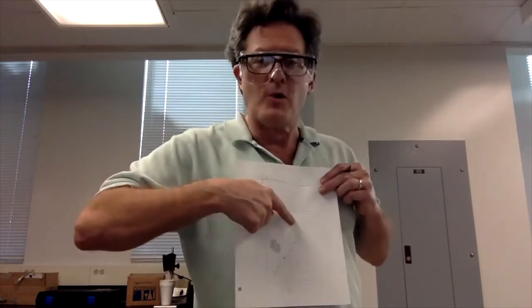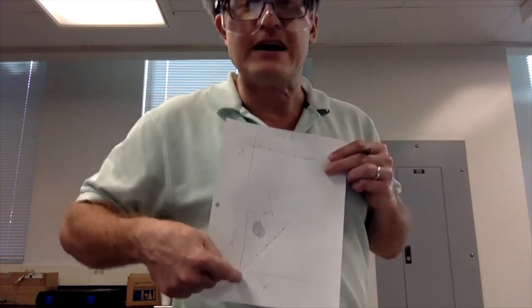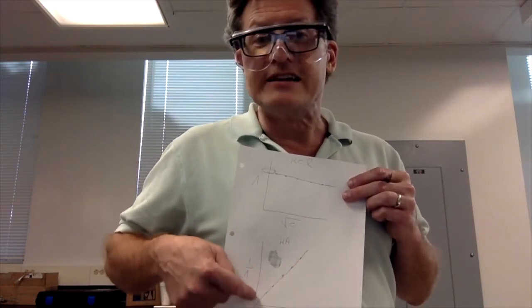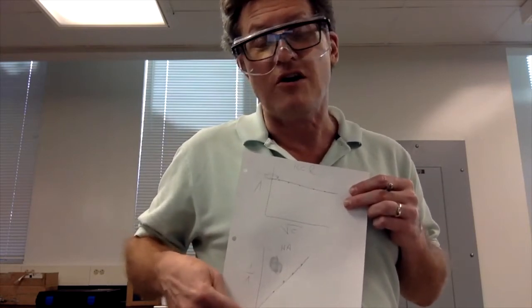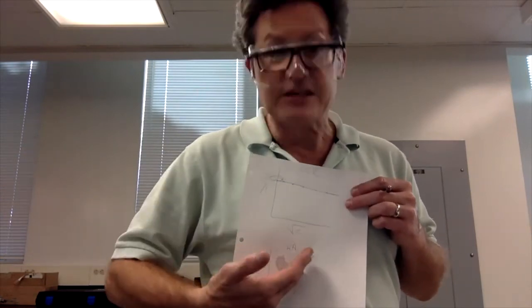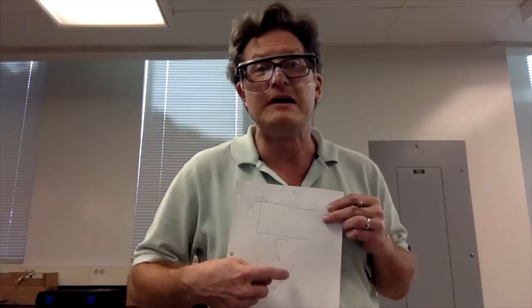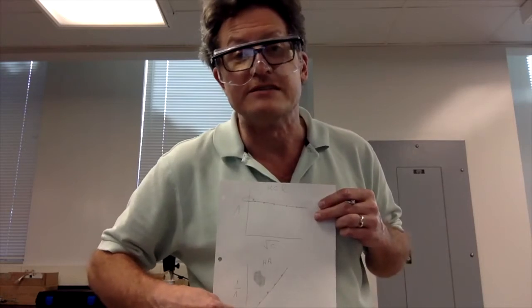Down here though, we're extrapolating a line towards 0. And we're trying to measure a value down here. If we have a small offset, but the offset is comparable, oh, wait a second, we're trying to measure a number that is close to 0. It's going to be really hard. This intercept here is very sensitive to offset errors. The slope is insensitive to offset errors. So if we measure a value of the limiting molar conductivity from the slope, it should in general be more accurate than the intercept in this case.